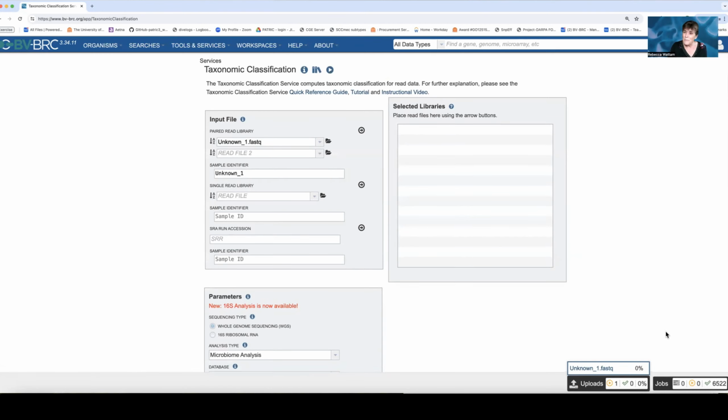These files are big. It takes a long time to upload them. So it's telling me the yellow means in progress, the check mark means completed, and the percent means the percent complete. You can't start a job until this is successfully completed. Notice that the name is here while it's trying to upload.